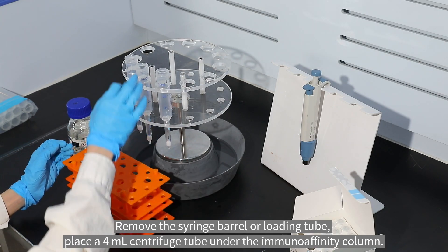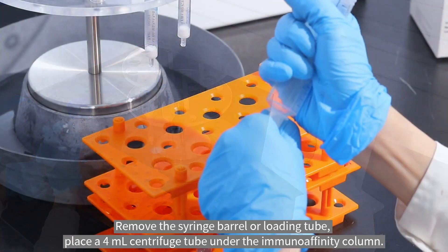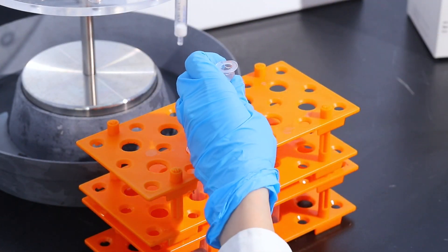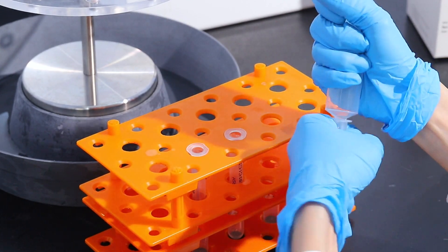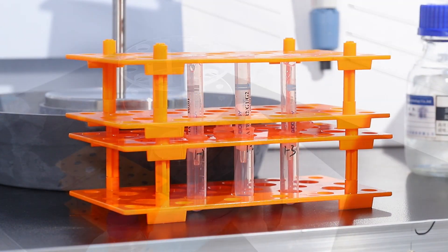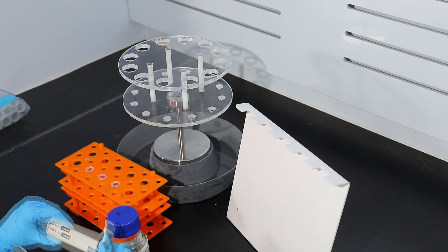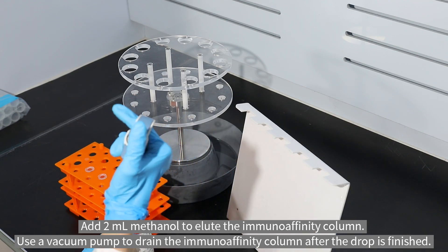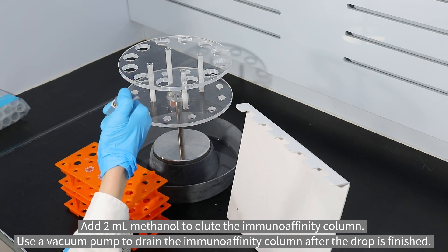Remove the syringe barrel or loading tube. Place a four milliliter centrifuge tube under the immunoaffinity column. Add two milliliter methanol to elute the immunoaffinity column. Use a vacuum pump to drain the immunoaffinity column after the drop is finished.